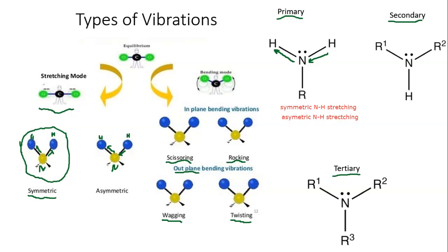So that's another type that can stretch as well. Again, these are very simple, fundamental compounds. When you go to organic chemistry, it gets a lot more complicated. This is just trying to introduce you to the concept. So this is somewhere there when you hear it again. So another thing we can stretch.